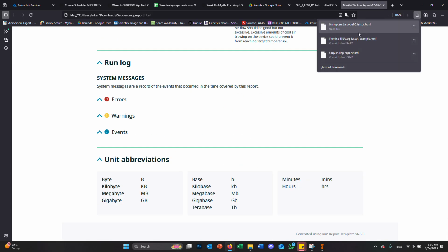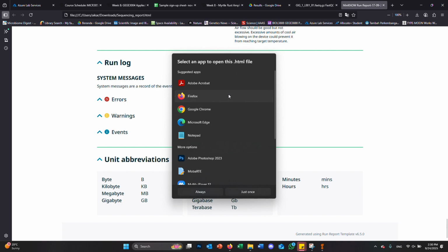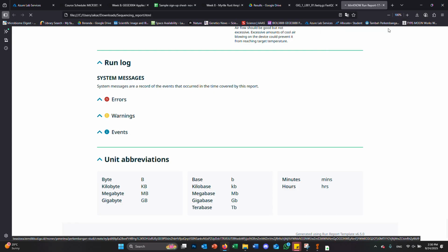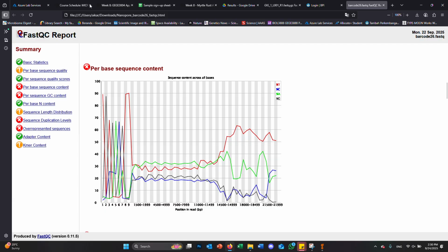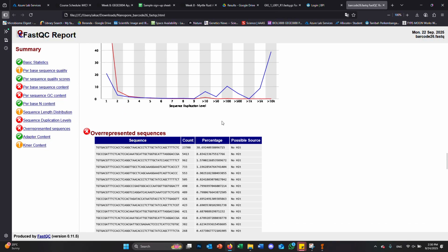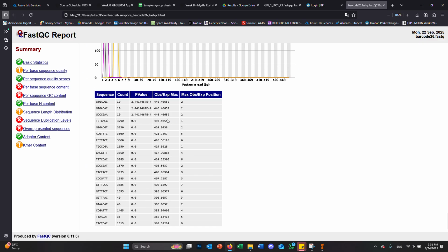Presumably this is HTML. It's possible that when we did the FastQC in that file, it was maxed out at 40, but it's also showing that the Illumina one doesn't have any variation. So all the reads are just good. There's not a range of reads where some are a bit good and some are better and some are worse. They're all just really good. So it's also visible as a range in the data.